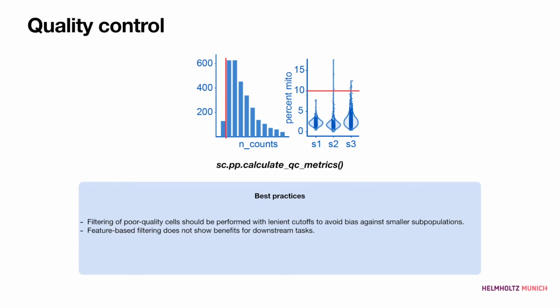But these are mostly the ones that I use. I also look at the cell cycle, if I'm interested in, I mean, that depends on what kind of subsequent analysis I want to do, cell cycling scores, because maybe I'm not interested in the actual cycling cells, because that might confuse my results. Exactly, that depends on the in and out type of story.